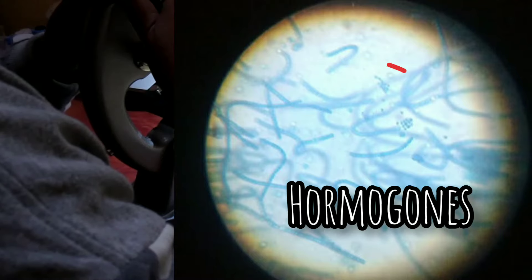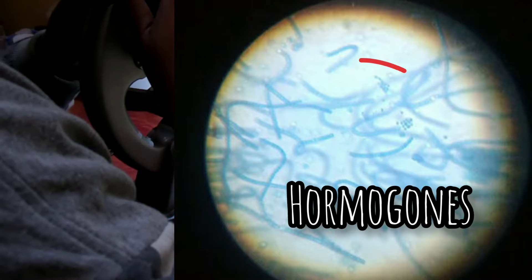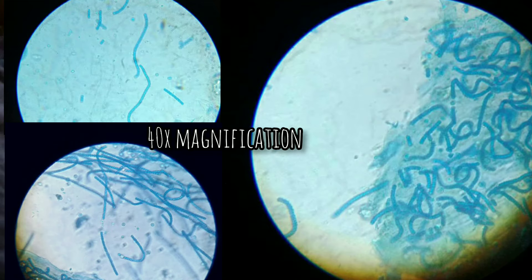The filaments also break into a number of pieces, that is hormogonia, by the decay of ordinary cells. According to Smith, hormogonia often develop into new trichomes without being liberated from the colony. It is documented that the reproduction takes place by hormogonia and akinetes. This is all about the simple salient features of Nostoc based on microscopic images.